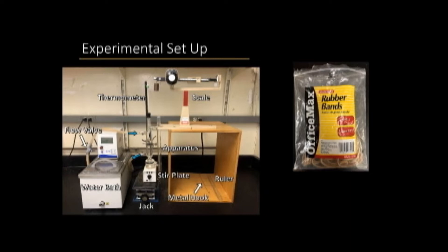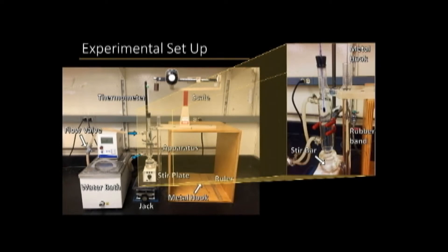This is the experimental setup for the experiment. A water bath is attached to a glass apparatus to heat the water surrounding the rubber band, which can be controlled using a flow valve. Water can be circulated around the rubber band using the stir plate and stir bar. The stretch length of the rubber band can be adjusted using the jack. The rubber band is attached to the apparatus and the metal hook which is attached to the scale. Force measurements will be made using the scale, temperature will be measured using the thermometer, and a ruler can measure length through the glass apparatus.